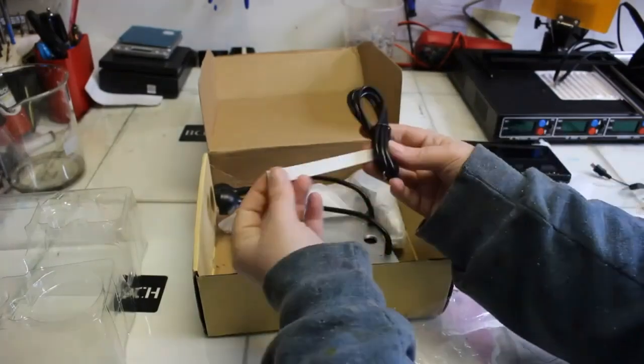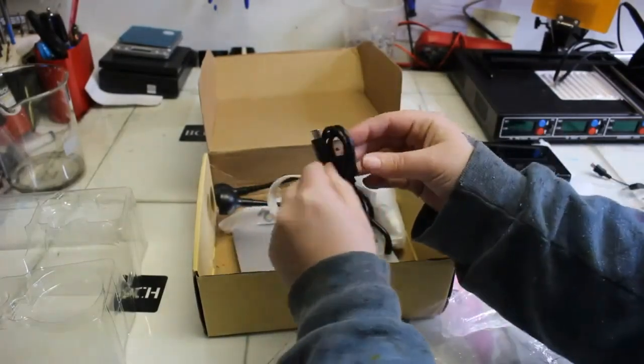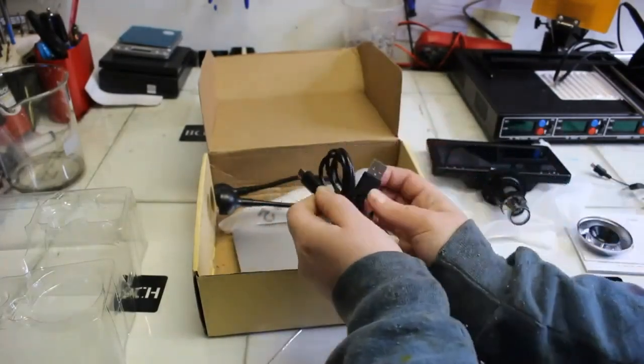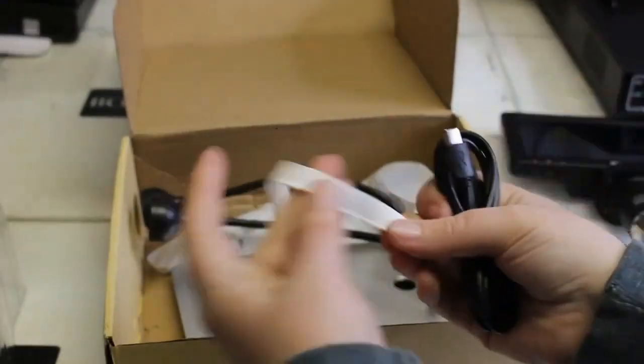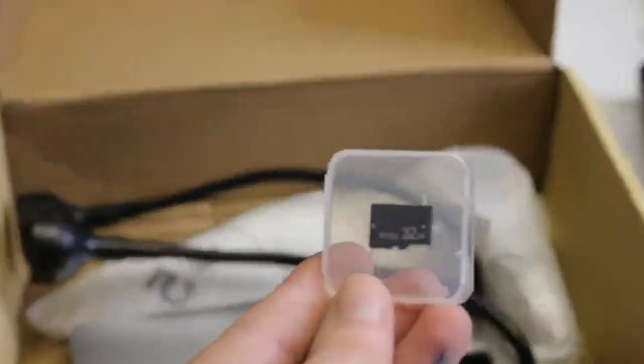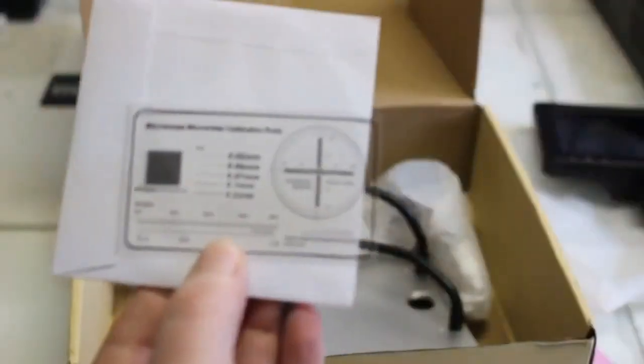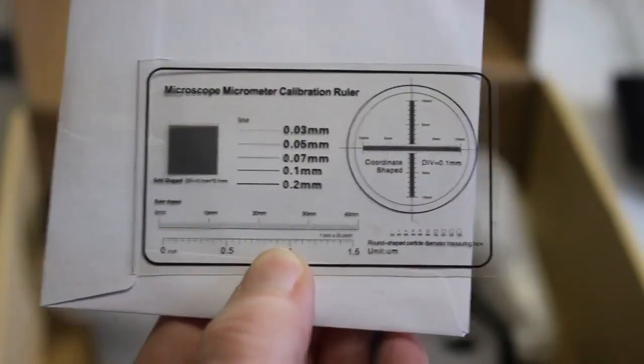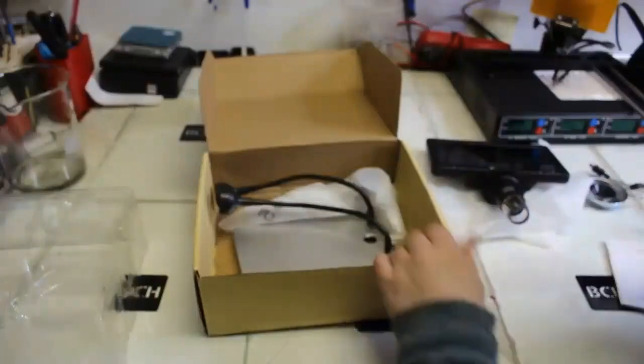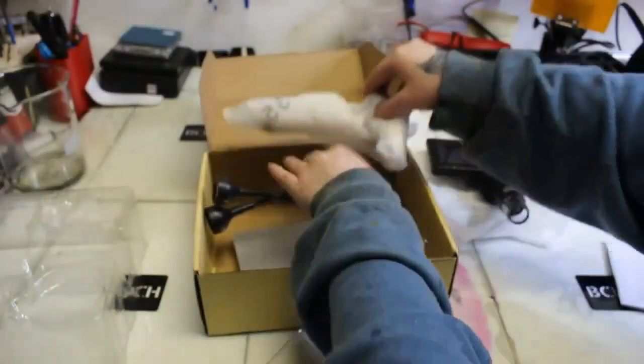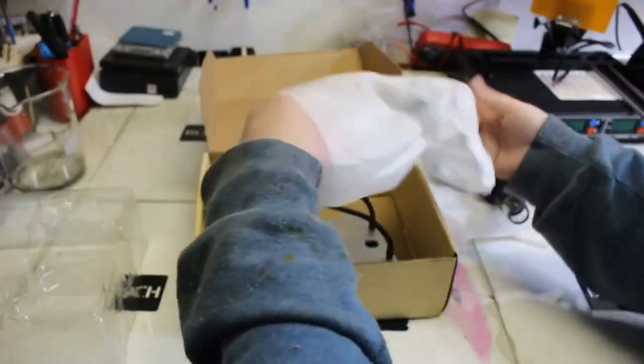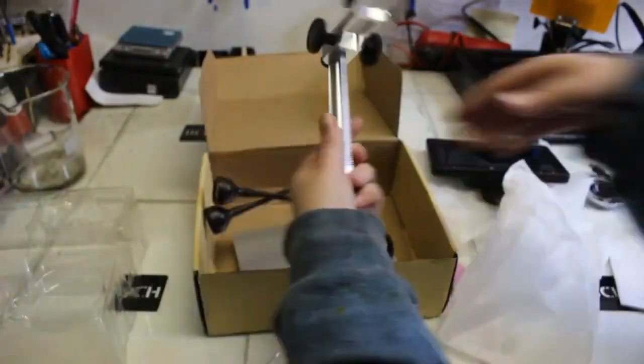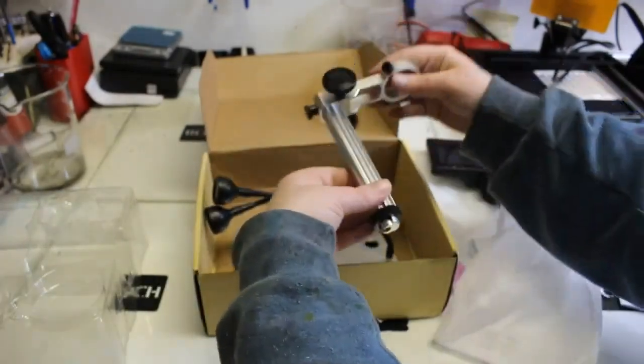In this bag you get a cord, a USB cord. Then we have the SD card that was in a little plastic container. Then I got this microscope micrometer calibration ruler. I thought that was really cool so we can measure things very microscopically.